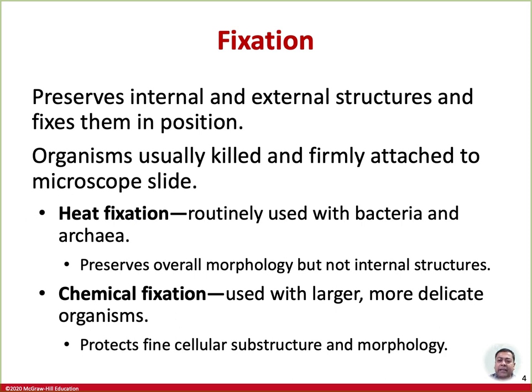It is gently heated, and the heat fixation preserves the overall morphology and inactivates the enzymes. It also destroys the protein in the subcellular structure, which may distort their appearances as well. The important part is that it preserves the overall morphology, but not the internal structure. This is the most important: overall morphology, not the internal structure.